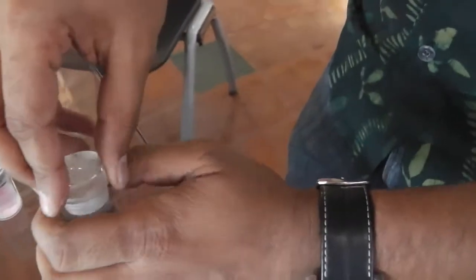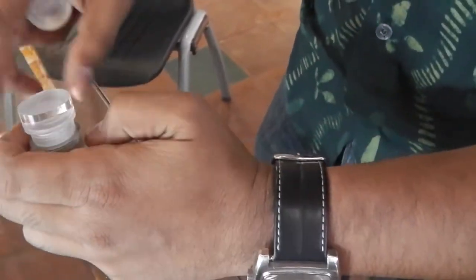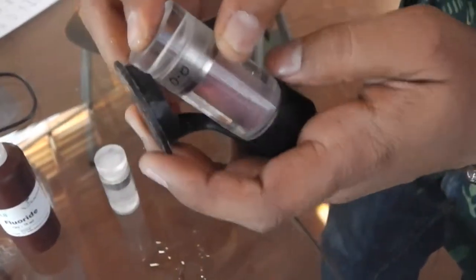Then you close it, and it cracks open — the reagent cracks open. Once you shake it, you see a change in color, and then you load it onto your phone.